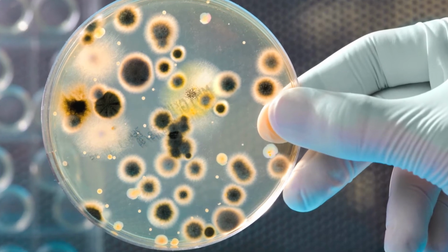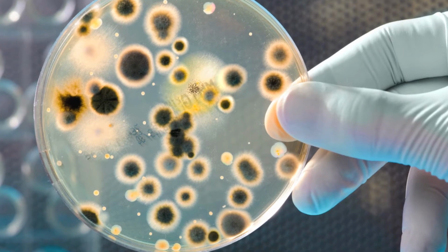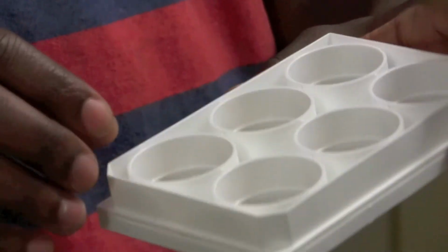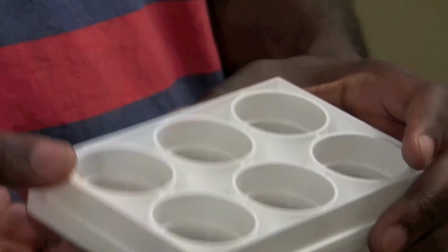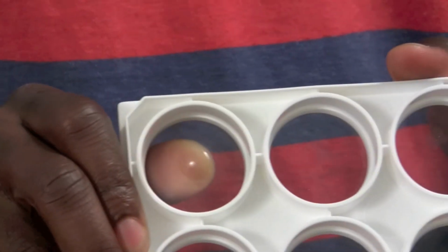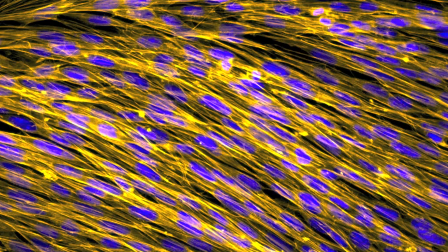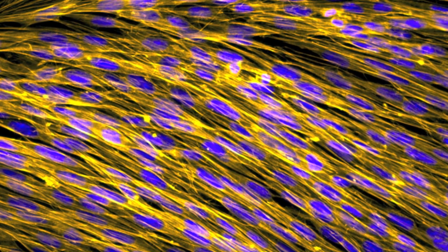Normally cells are grown on plastic, but in order to get an idea of how cells respond to something like stretch or contraction, we use the silicon membrane, which is very elastic. So when we pull it, we can see how the cells on this membrane respond to the fact that the thing they're sitting on is being stretched. And so in this picture, that's what you kind of see. You see the cells responding to contraction. They elongate and they align with each other in one direction or the other, depending on how we induce the contraction.